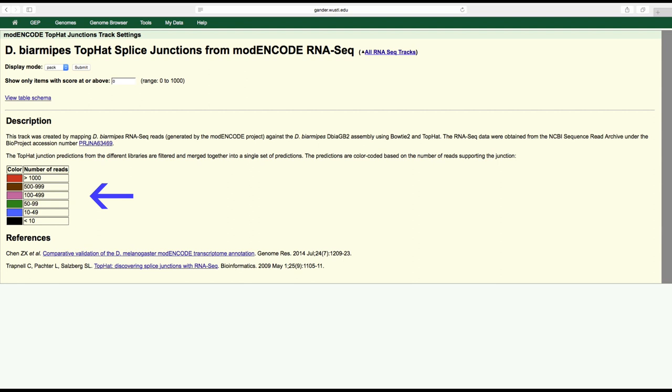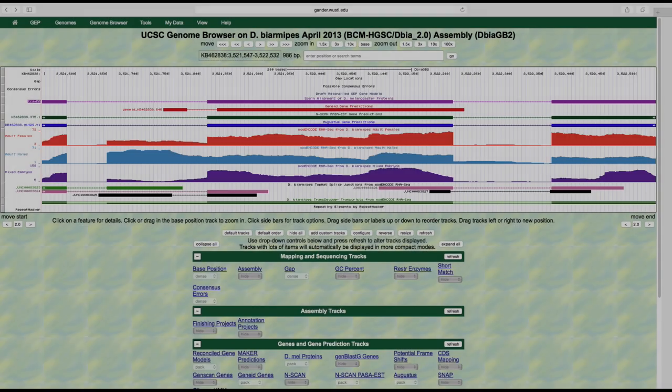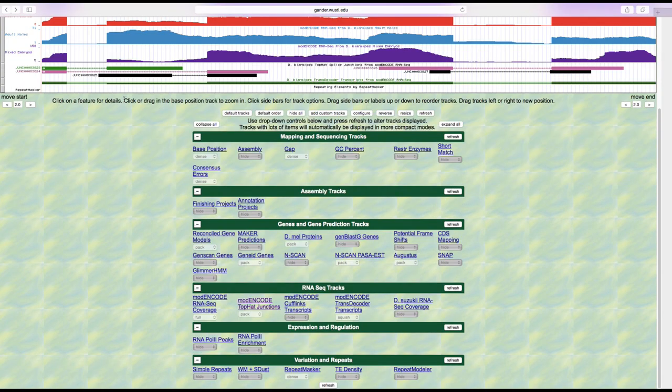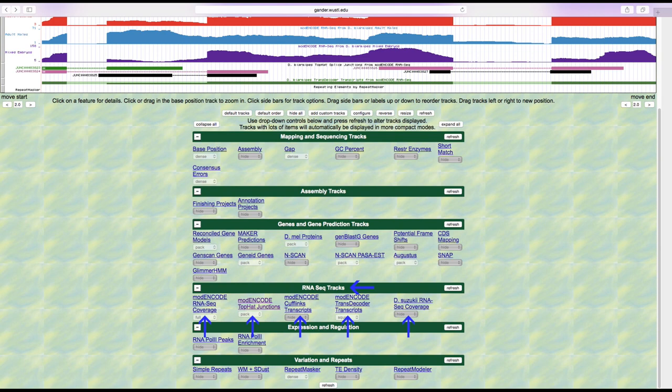Several other evidence tracks are available under the RNA-Seq track section. You may click on the track title link above the display mode drop-down list to learn more about how that evidence track was created and the display convention used by that particular track.